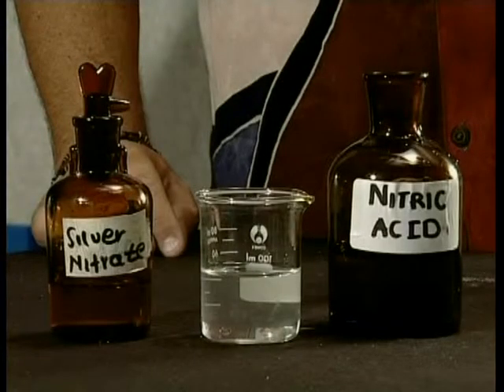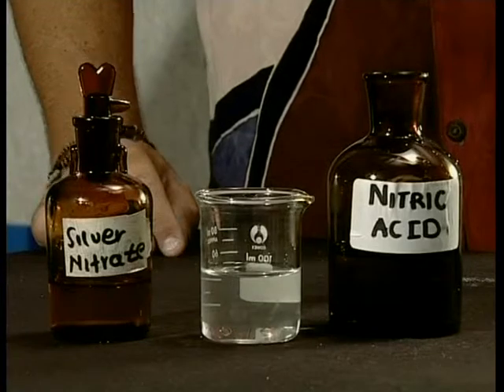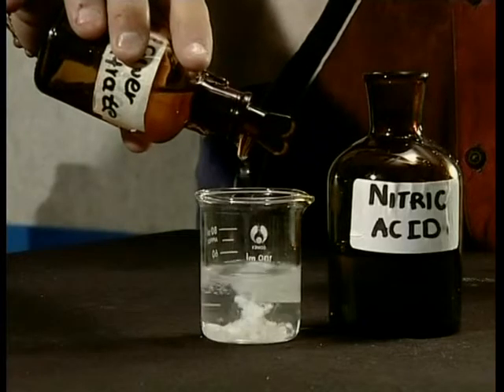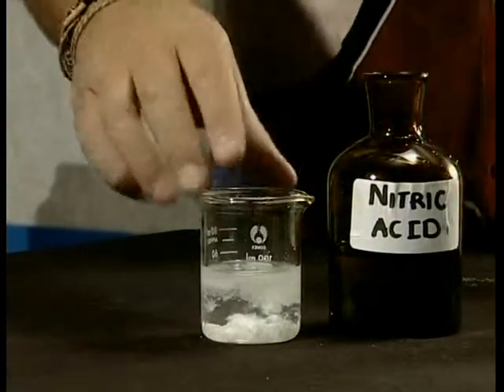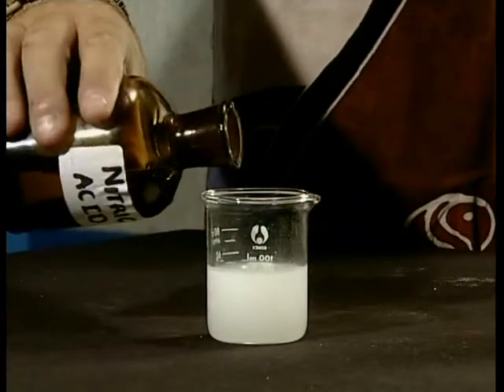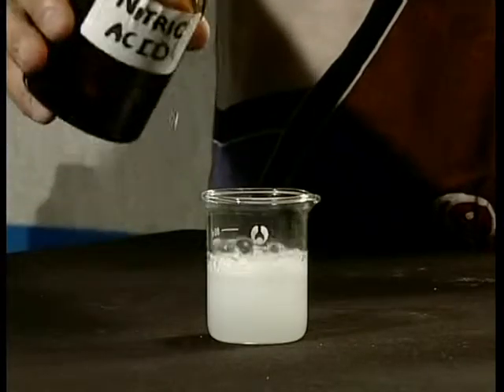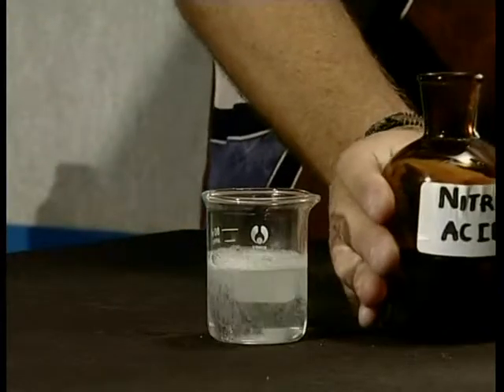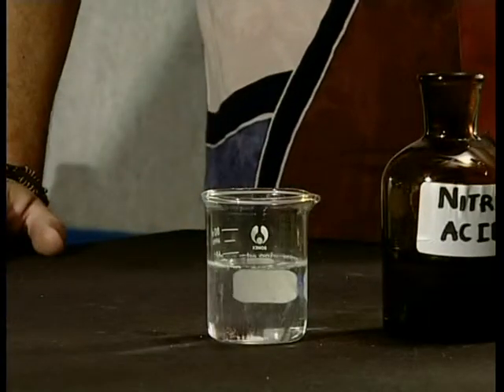In this beaker, we have a solution of a sodium salt. The anion is unknown. Let's do the halide test to see if a halide is present. We add a drop of silver nitrate to the solution, and what do you see? A white precipitate. Now add a few drops of nitric acid. Look at what happens. The precipitate fizzes and produces bubbles and then dissolves. So we can conclude that a chloride was not present. What was the precipitate that was formed, and why did it dissolve in the acid?